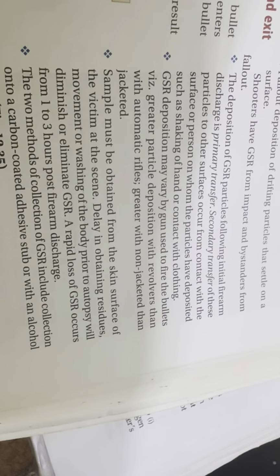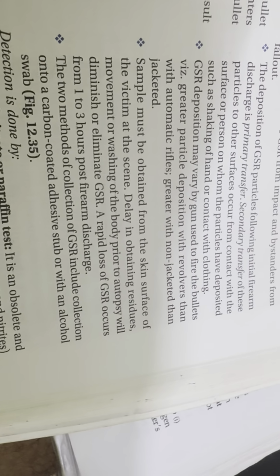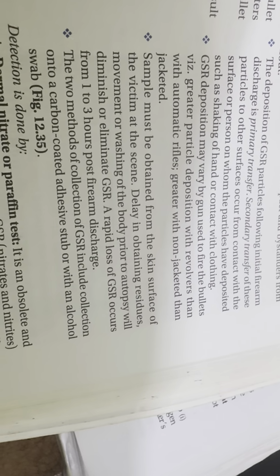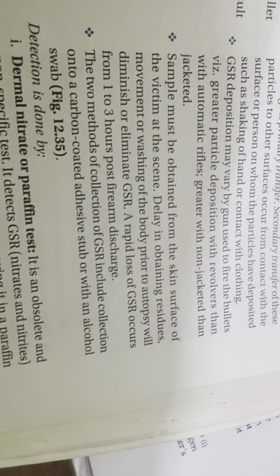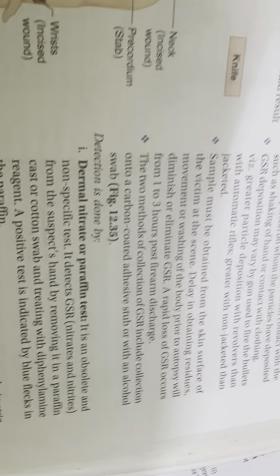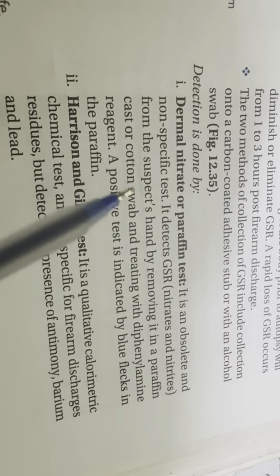Samples must be obtained from the skin surface of the victim at the crime scene. Delaying obtaining residues, movement, or washing of the body prior to autopsy will diminish or eliminate the GSR. Methods include collection onto a carbon coated adhesive stub with an alcohol, or a swab.